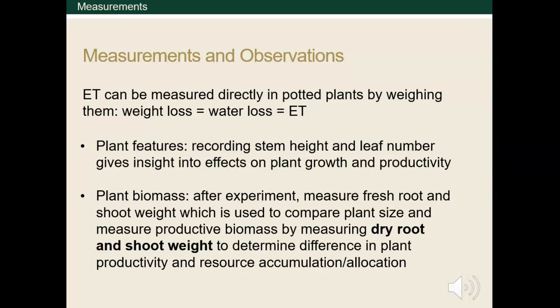We're going to make some general observations before the end of the experiment and note color, size, and overall visual differences. But after the 4 weeks, we have a couple things to record. One of them you're already familiar with is plant height, and we're going to record leaf number too. Leaves are source organs because they are the site of photosynthesis. Drought stress impacts leaves and inhibits photosynthesis, so it will be interesting to see any difference in leaf number after the 4 weeks.